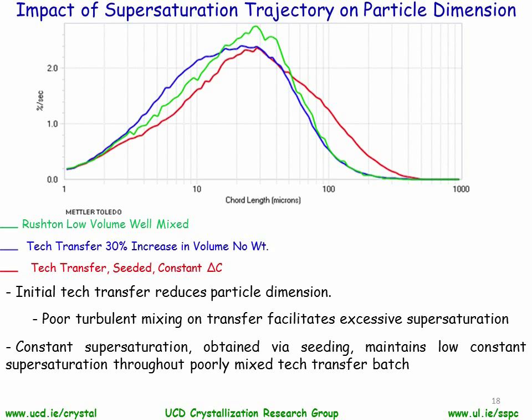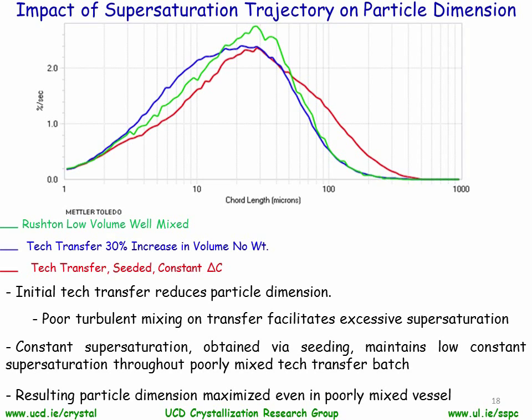So again, we just wanted to highlight here, it's a qualitative method, but it does open the door for really assessing and troubleshooting crystallization systems, particularly when we're looking at tech transfers and scale-ups.